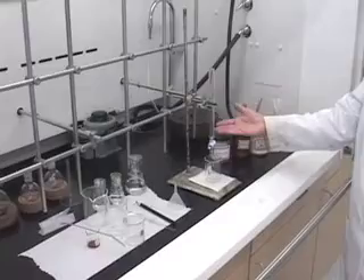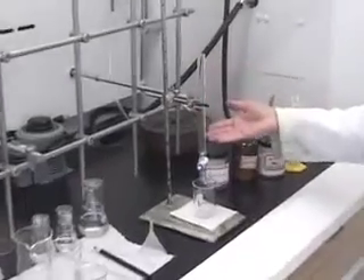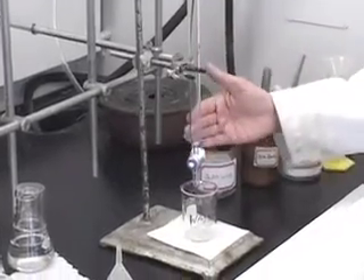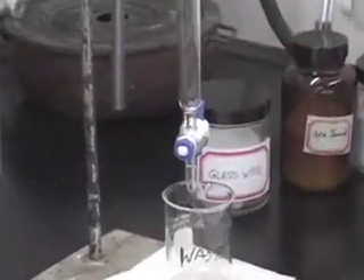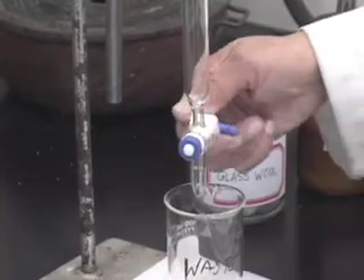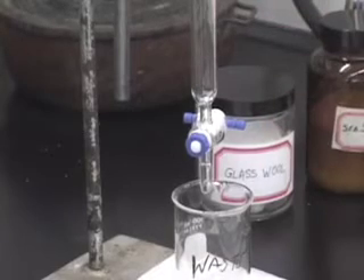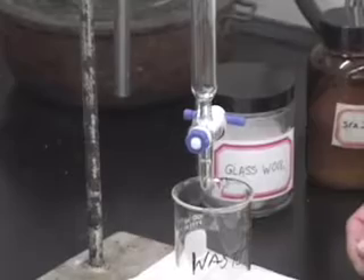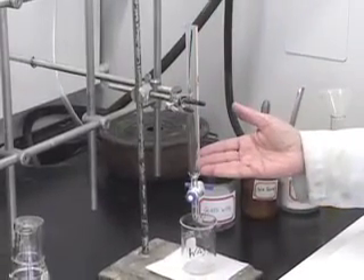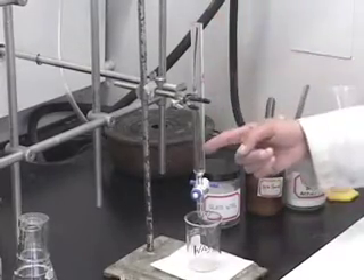Now we are going to prepare the column to separate the mixture. How do we prepare a column? This is a glass column that you see here — it looks like a burette which you have used before. There is a stopcock here in the vertical position; it is open, meaning whatever is in here will drain through a hole in this Teflon stopcock. If you turn it horizontal then it is stopped and there is no flow of solvent taking place. Remember, column chromatography is a type of adsorption chromatography, which means there has to be a solid stationary phase and then we will be adding the mobile liquid phase.